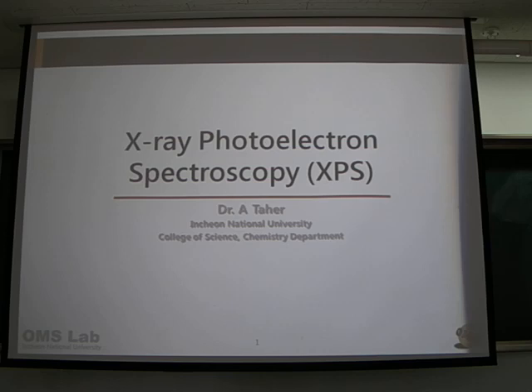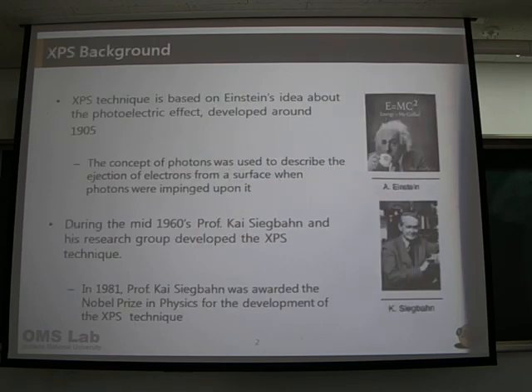I want to discuss XPS, that means X-ray Photoelectron Spectroscopy. It's a very good tool for surface analysis. First of all, I want to discuss the background of this XPS.